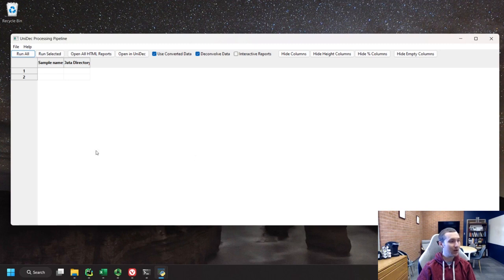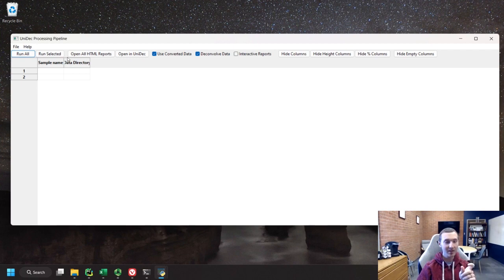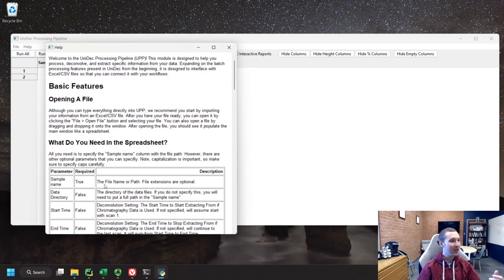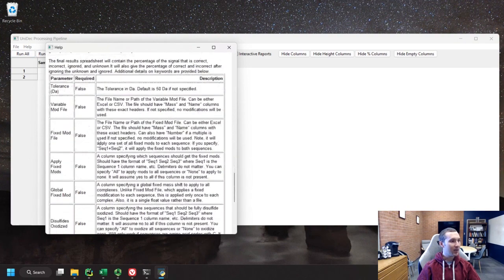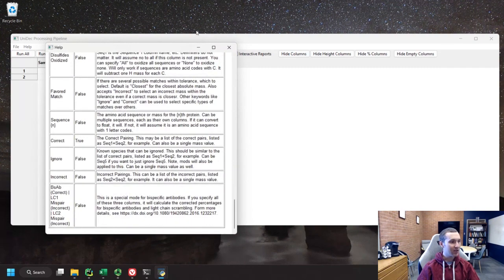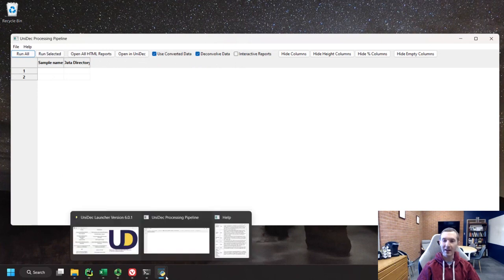When we launch the UP window, there are two major columns in this spreadsheet format. The first is sample name and the second is data directory. These names are specific code words, and it's really important that you know what they are. If you forget, there's a help file you can open up that describes all the different parameters you need and all the different things you can do. Don't hesitate to use it.